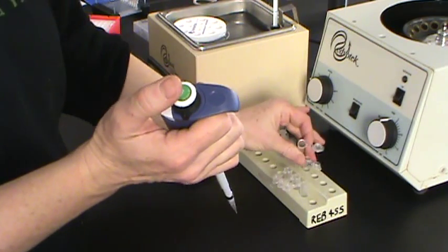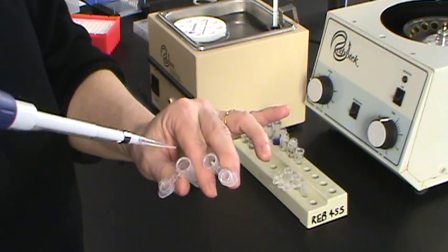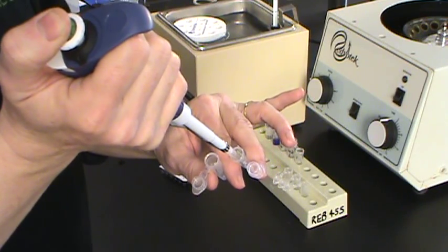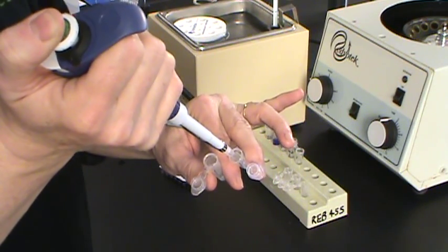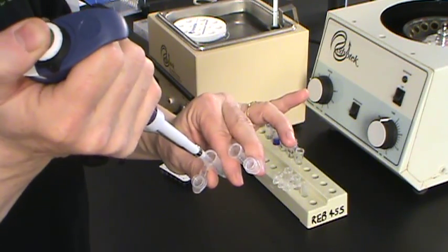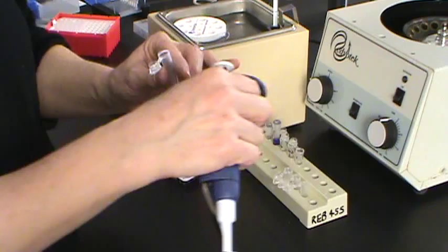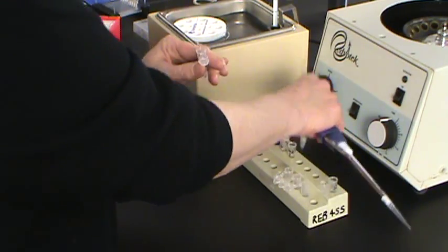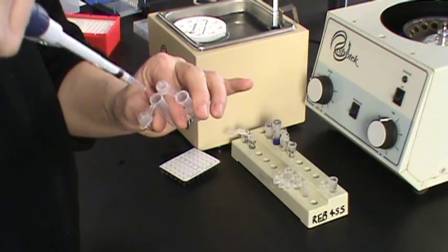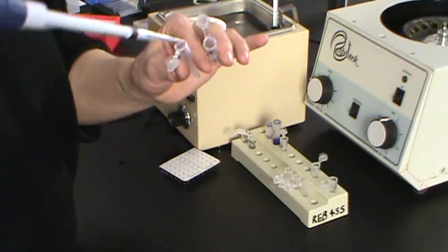Now, the volumes we're using are very small, and in these small tubes, we're going to have a number of things to add. So as we said before, we're going to push the plunger down, put the tip just under the surface of the liquid, let the plunger up, go into our next tube and plunge down to the second stop. That might be where we add our first DNA. And then we'll add our reaction buffer, whatever volume that is supposed to be, and our enzyme.